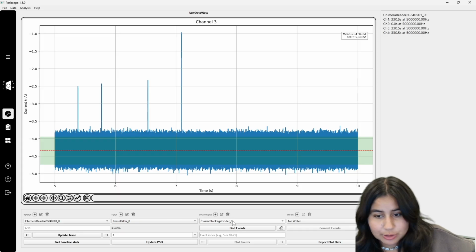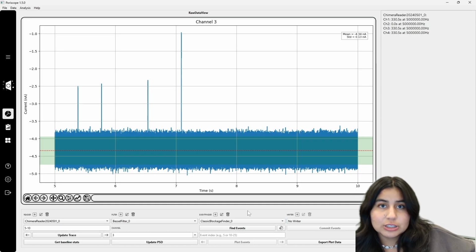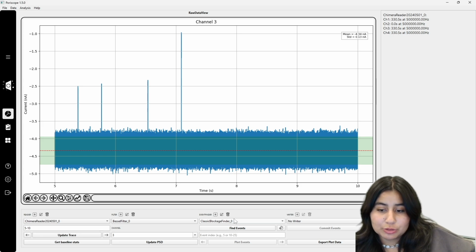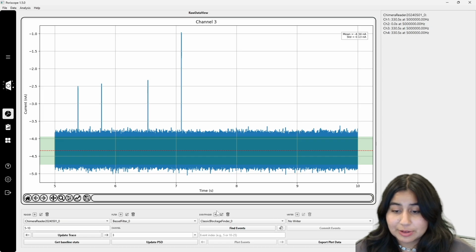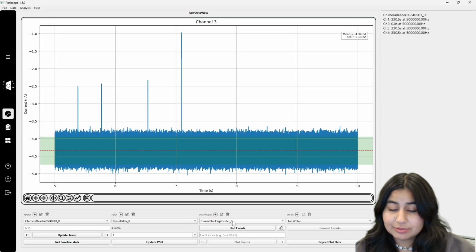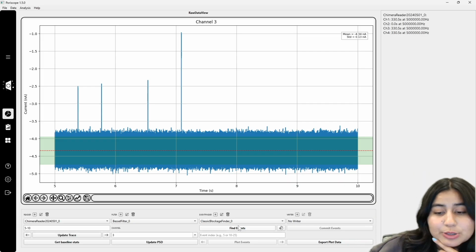Additionally, you can have multiple event finders, multiple readers. If you're using the bounded blockage finder particularly, it's because you're setting bounds. Not all channels may have the same bounds, so it's really common to have different blockage finders. You have one reader and different blockage finders with different bounds, and then you just keep the same reader but have different finders and find events according to each channel.